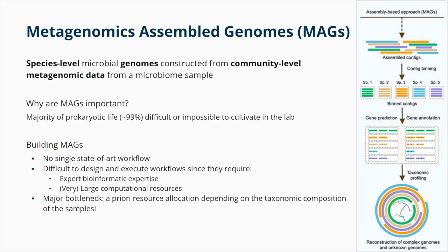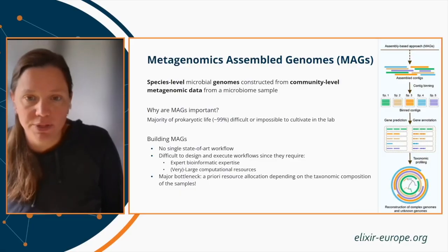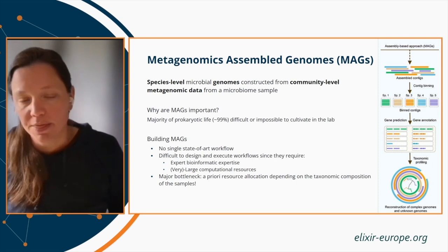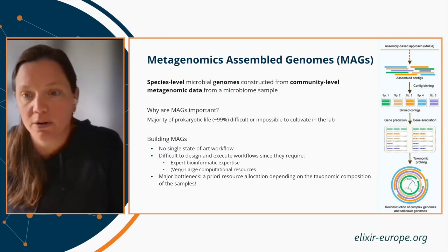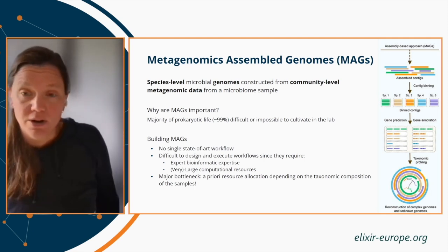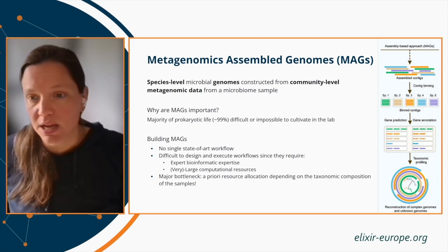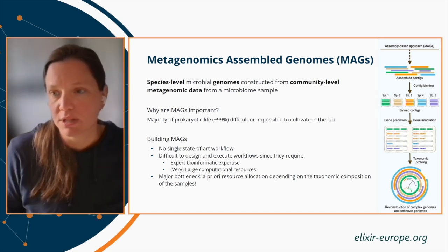But building MAGs is complicated. We have no single state-of-the-art workflow. These workflows can be difficult to design or execute because they require a lot of expert bioinformatics. They require large computational resources, and the resources depend on the taxonomic composition of the sample.